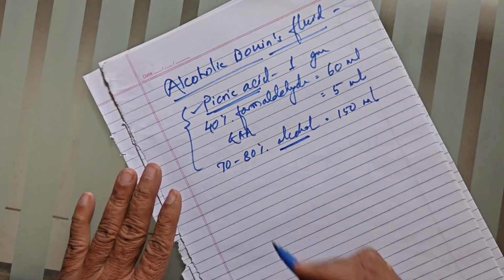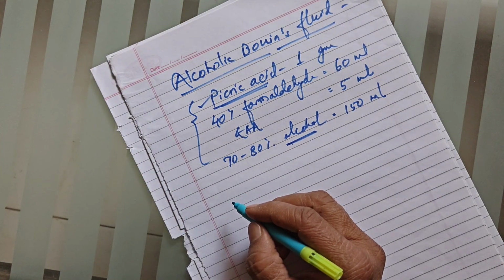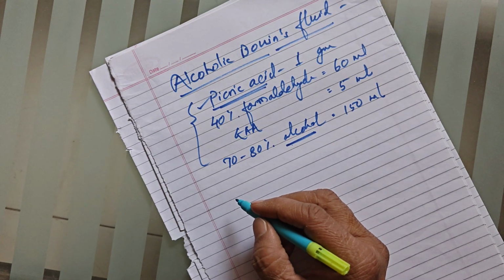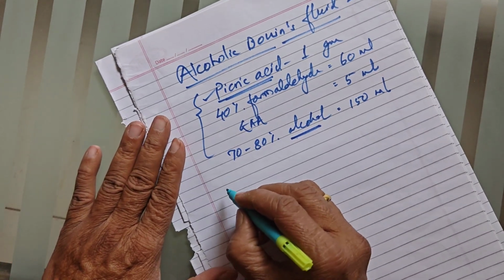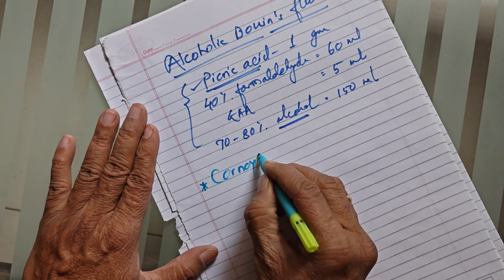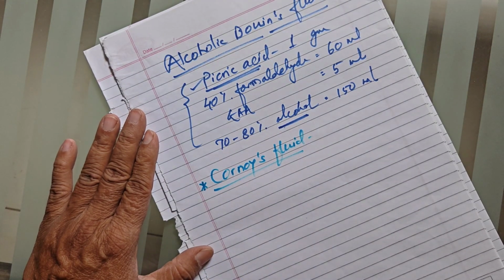Now the second type of fixative is Carnoy's fluid. How can it be prepared?